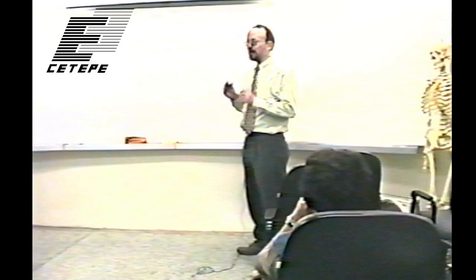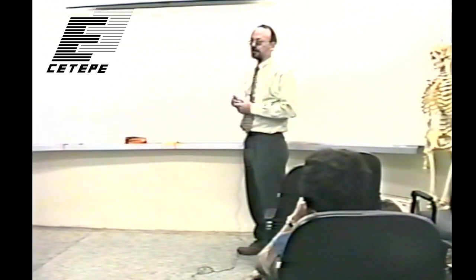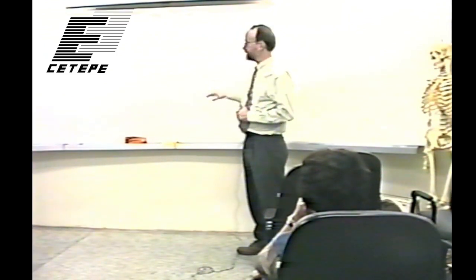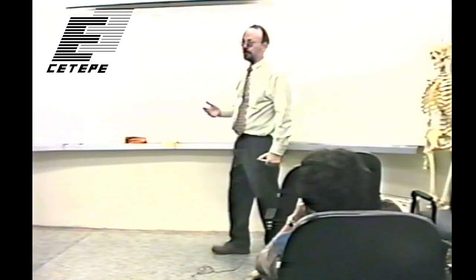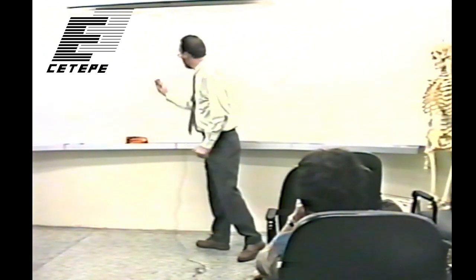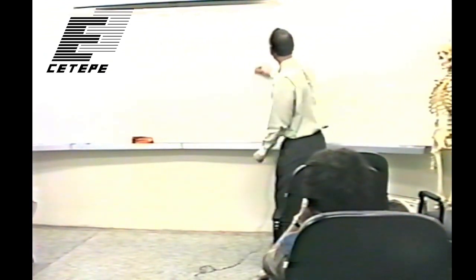It's not quite as good yet. It's still a little noisier, but you are seeing some consumer cameras come out now already with this. And I think soon it'll advance to the point where maybe they could even be used in science. And so CCDs will become dinosaurs and die out, I think.